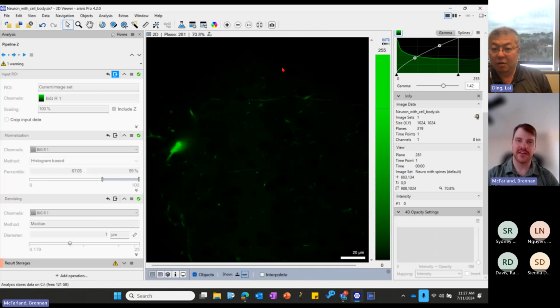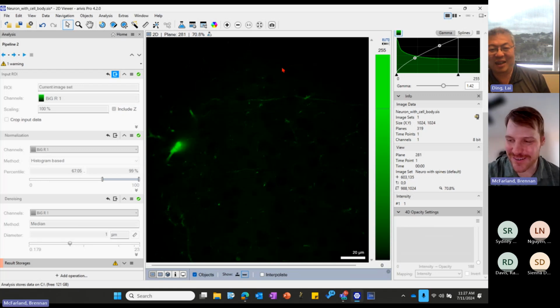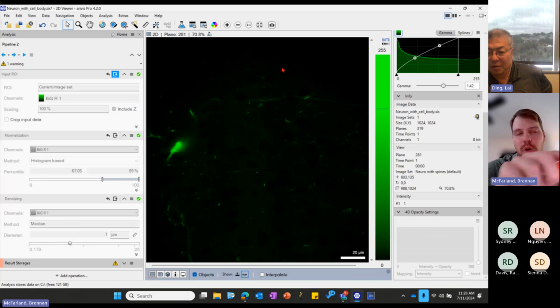Yep, the question? I would just feel it's enough for today, it's a lot of things. Yeah, we can save the last half hour for another day and add it on to another day. But I think that covers the rest of neuron tracing. It's just doing more pre-processing, but the steps are going to be the same, whatever gives you the best result.